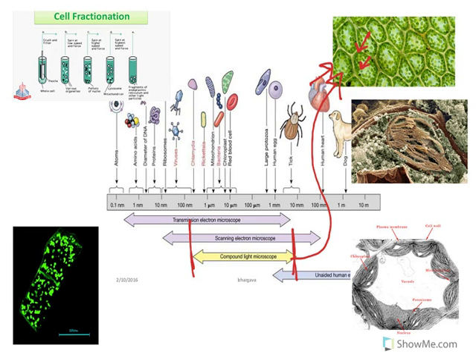So we have a new technology, and it's electron microscopy. What that does is they put a film of metal over the sample, and then they shoot electrons at it. Based off of the wavelengths they see with the electrons, it shoots back an image at them, so you can see a topographic kind of map of what is actually there on the organelle inside of the cells. So you get images like this and like this.